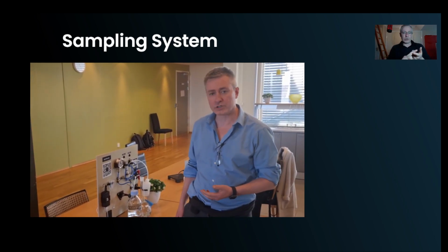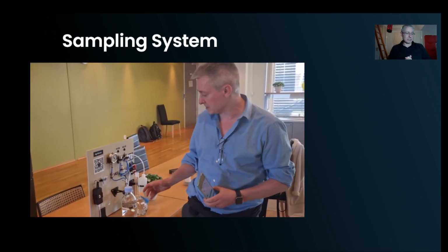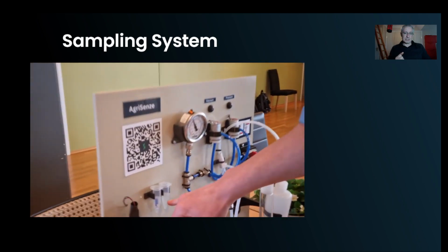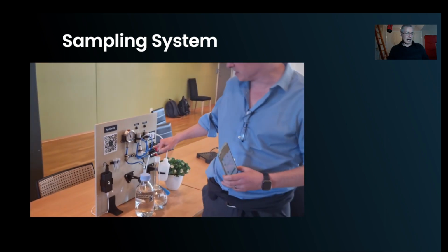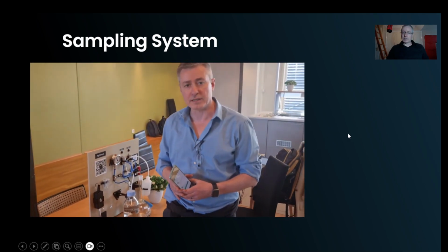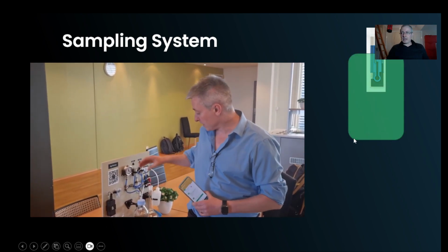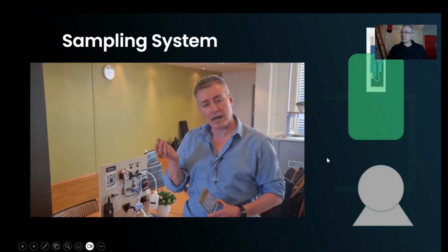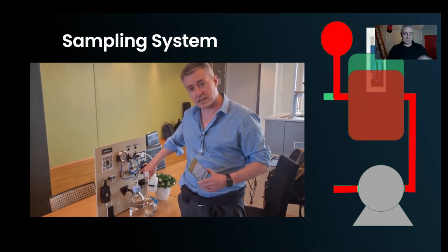If you're measuring the pH in runoff water, I think you're actually looking for a sort of sampling system plus pH sensor. If you're interested in measuring activated sludge, you probably need a full sampling system and then the sensor as well. Similarly, if you're measuring sodium in an agricultural, horticultural application, then you probably need to be using the kind of sampling system as well. In its simplest form, we would take the sensor, for example, put it in a flow cell with a pump system, and then there would be the sample, and we would basically suck the sample through and over the sensor.